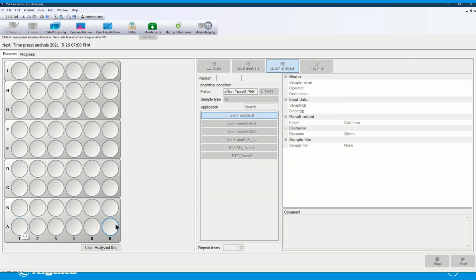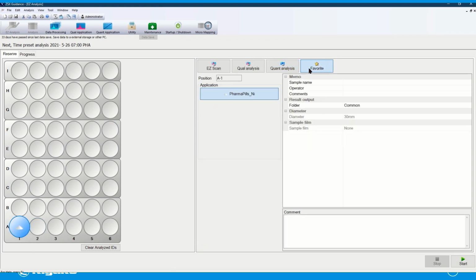And what it's saying here is that anything that it's set up with other conditions are gone. So here we go. Put it in, go to my favorites. That's the only method available here. And if you even wanted to, you can have it configured so the analyst only sees the favorite methods that have been designated. So this is really good for a quality control environment or open access where they only see those methods that they're going to use. And that's the only things that they will select.